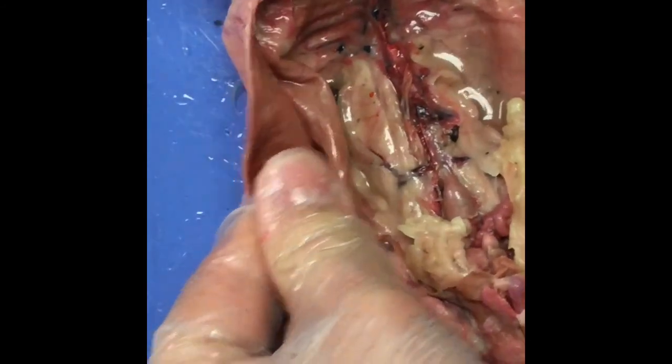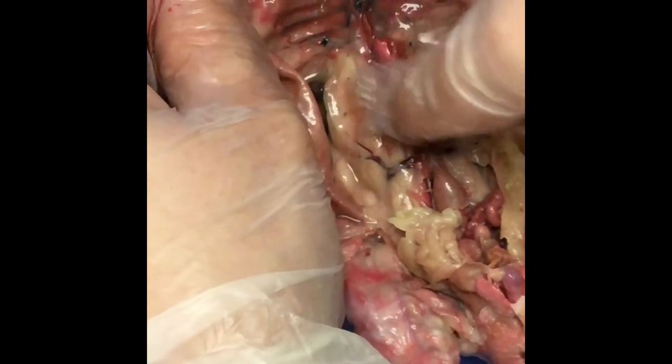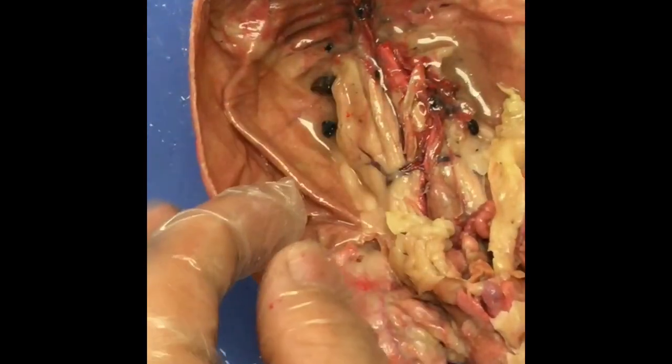Mr. Mount, what's that yellow stuff? Fat. Visceral fat. So, you see the spinal cord running down the back, right through here. Can you see that? I might have to scrape some of this away.